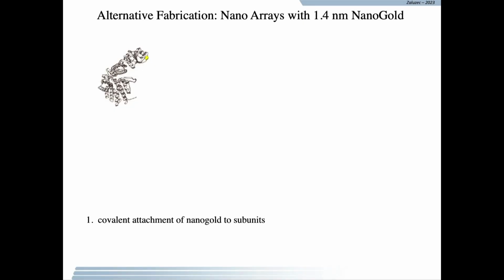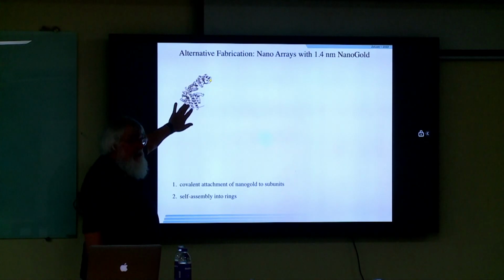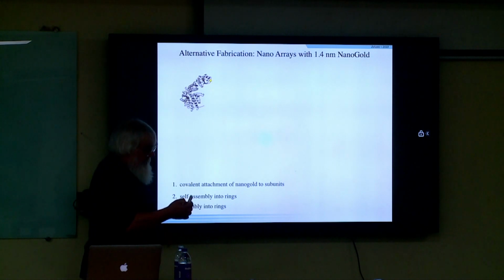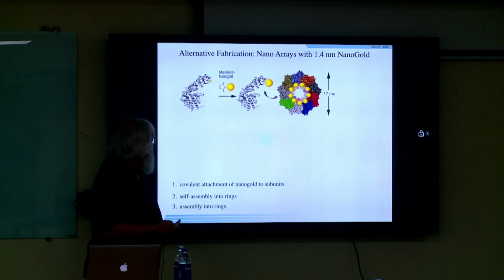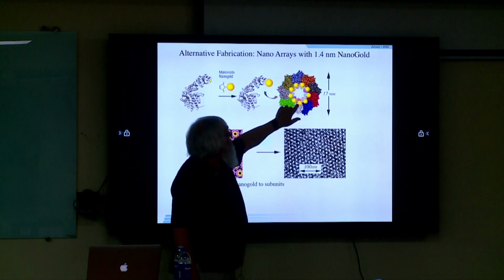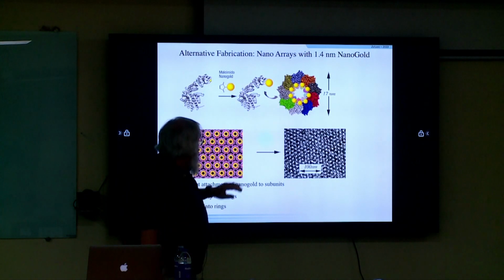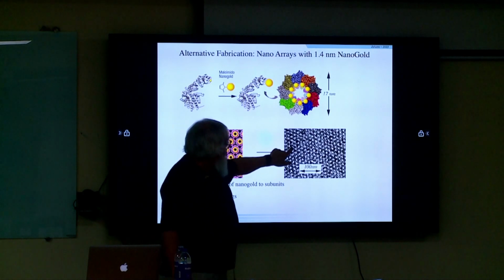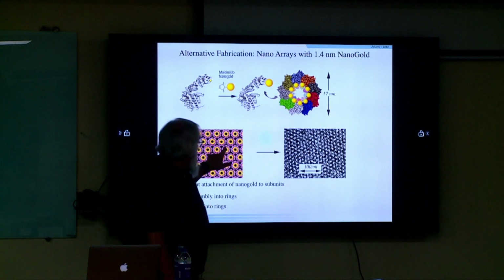Let's look at something else. Let's look at some nano gold, and this is in a biological material. We have little particles of gold. The structure, theoretically, of this biological material was an array of gold spheres surrounding a periodic structure. That's what we think it looks like. These guys would collapse down to a single point. There are an array of golds.